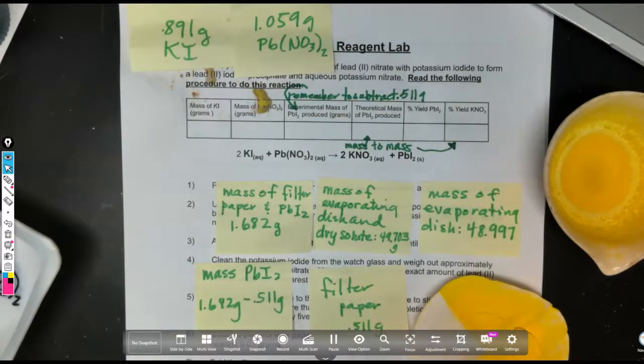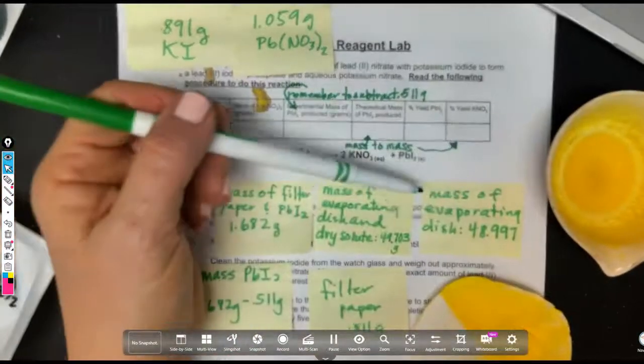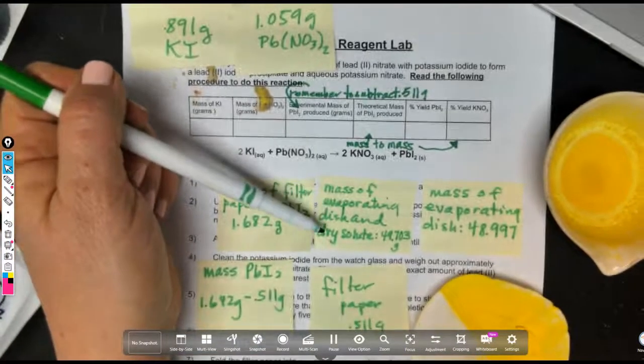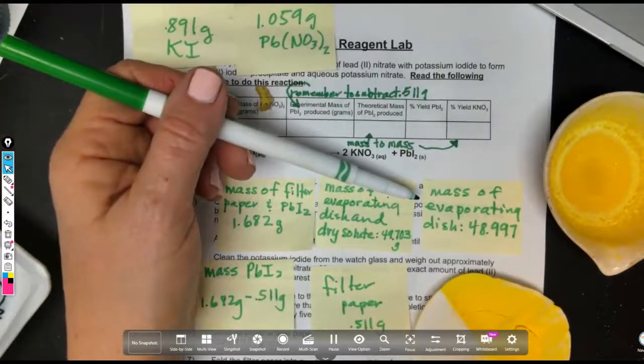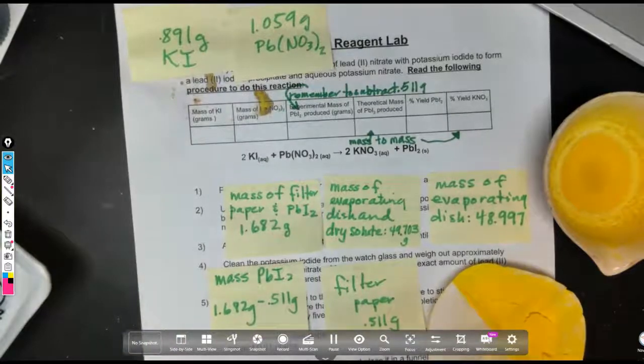So if we know how much KNO3 should have been produced from the limiting reactant, not the excess reactant, then we know a theoretical yield. We know an actual yield because we have this mass here, which is the mass of the evaporating dish and dry solute minus the evaporating dish. So we know the actual, and we can find the percent yield of the KNO3.